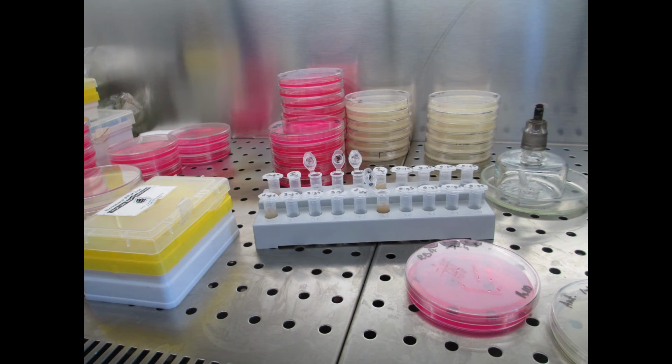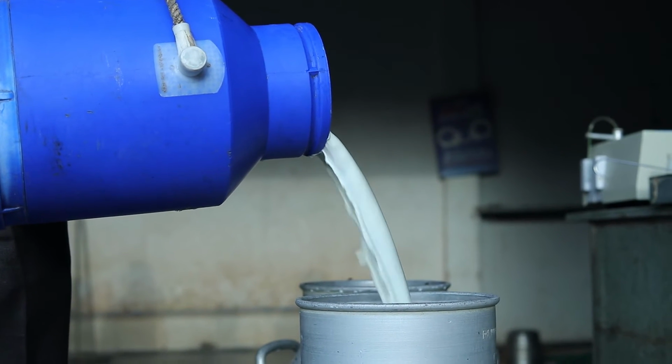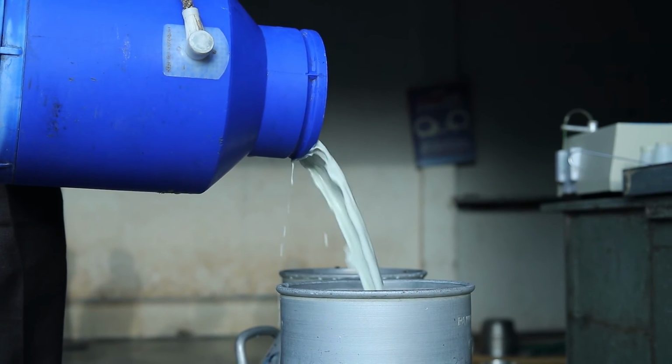If you're in a lab that has the Level 1 designation, the microbes you're going to be working with are generally known to have no consistent cause of disease in a human, and so if you're a healthy, otherwise fit individual, there should be no risk to you whatsoever, and the chances of the disease breaking out and causing harm to others are equally minimalistic. Examples of this are things like E. coli. Something like this might be found in, say, a food safety laboratory, where quality control analysis is conducted to identify if any pathogens somehow have found their way into the foodstuffs.